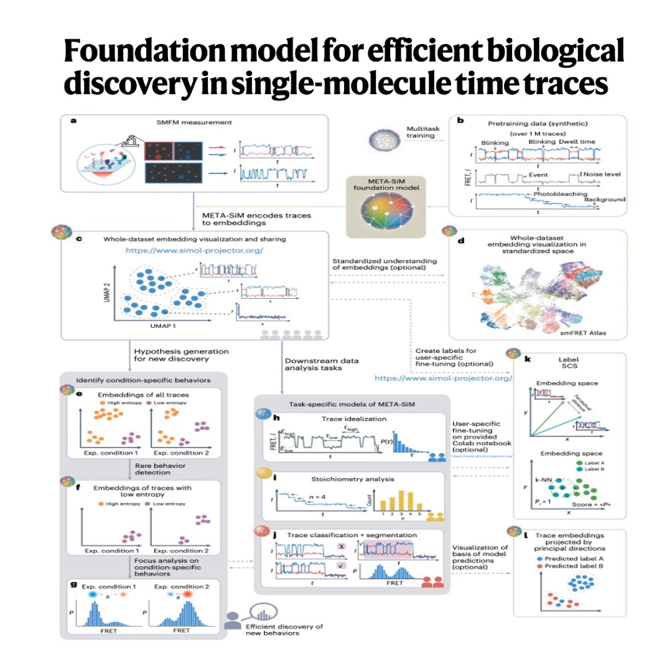Okay, so first off, that term foundation model is key. It's a shift in thinking from older machine learning approaches. How so? What's the difference? Well, traditionally, if you wanted to use ML on your SMFM data, you'd train a model for one very specific task, maybe just classifying traces. This looks dynamic, this looks static. The one-trick pony, basically. Exactly. But a foundation model, like the big ones driving things like ChatGPT, is different. It's trained to learn general representations of the data itself. It learns the underlying language of the data, if you will.